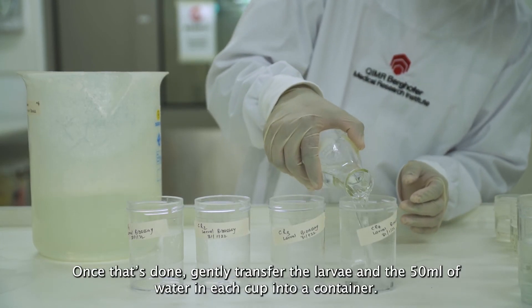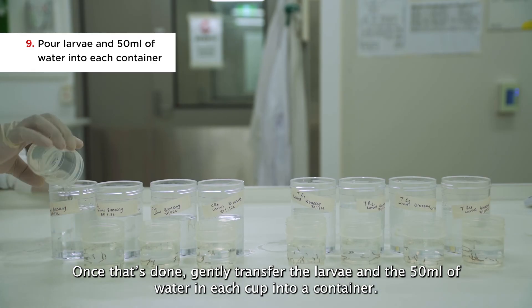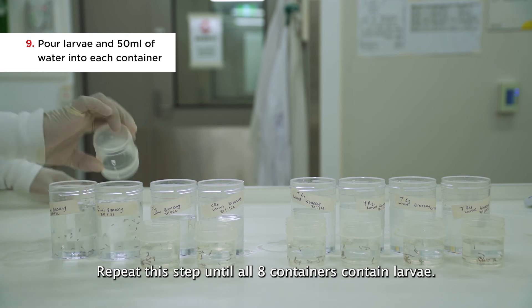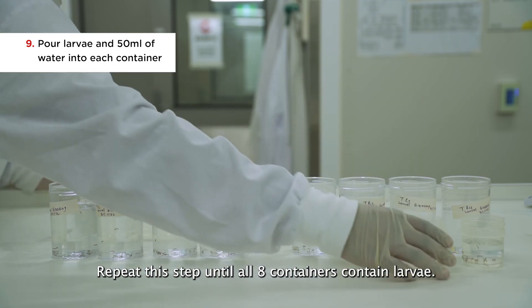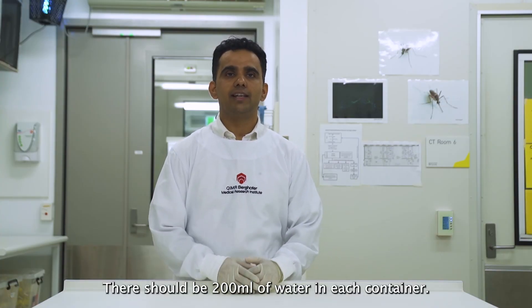Once that's done, gently transfer the larvae and the 50 ml of water in each cup into a container. Repeat this step until all eight containers contain larvae. There should be 200 ml of water in each container.